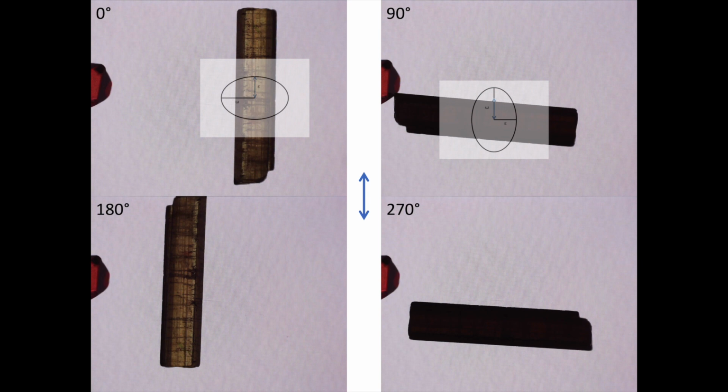So our pleochroism is actually explained fairly simply by thinking about the crystal in this way. When our plane polarized light aligns with epsilon, we see the pleochroic end-member color associated with epsilon. When the plane polarized light aligns with omega, we see the pleochroic color associated with omega. And everywhere in between is a mixture of these 2.